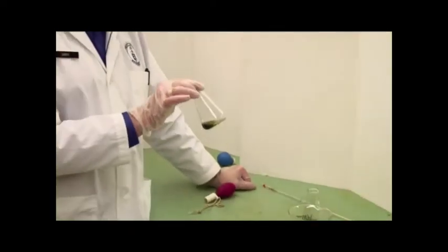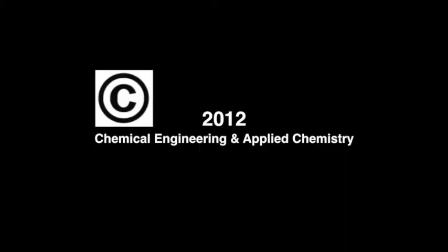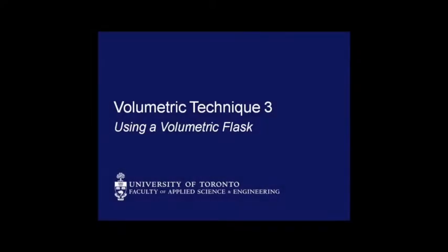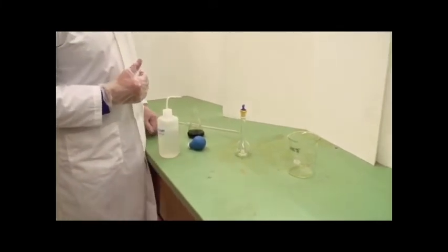In the technique that I've just used, I have now dispensed 10.00 mils. That's exactly 10 mils of, it's actually bromocresol green liquid, into this flask. This is a 100 ml volumetric flask, and we'll show you now how to use volumetric flasks themselves.